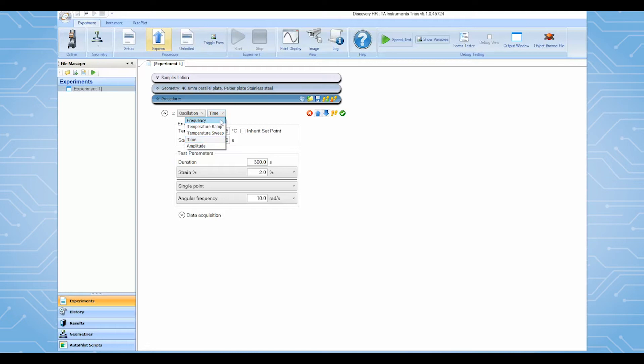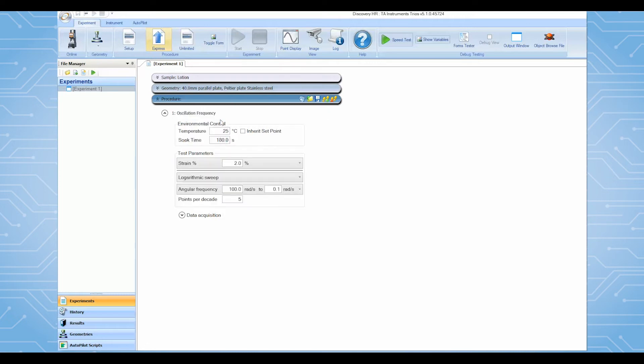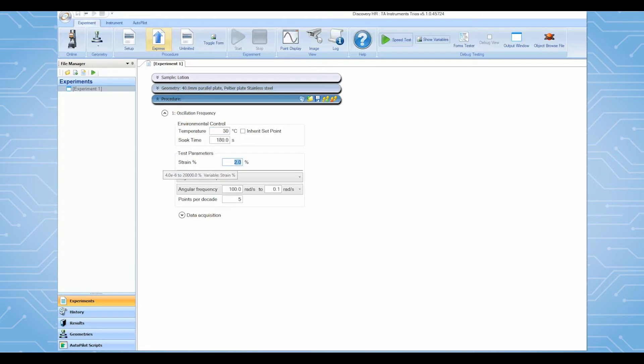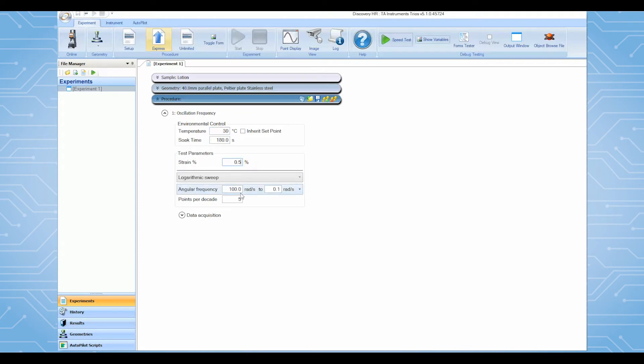The default frequency range and testing parameters in this procedure are good to use for the majority of common samples. You will only need to enter your desired test temperature and an oscillation strain which needs to be in the linear viscoelastic region of your specific sample. You can also change the test frequency range if needed.